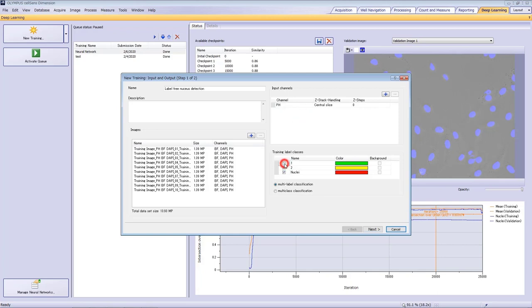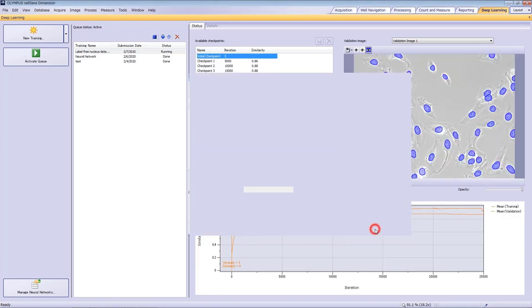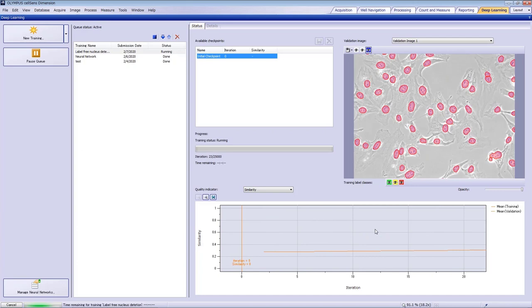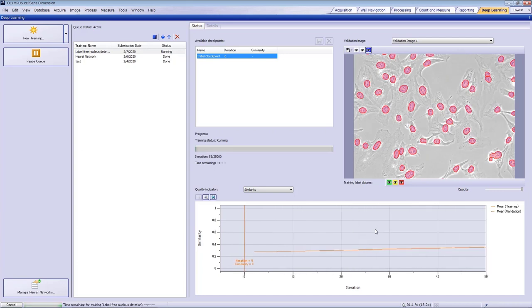The training label class is nuclei only, and we defined it in the previous video. Now, we can select the training configuration. In many cases, the standard network is OK. The large network is appropriate for more complicated structures, but it takes more time. Let's keep the default iteration. If necessary, we can increase it later. We used an NVIDIA Quadro P2000, and the process took about 50 minutes.